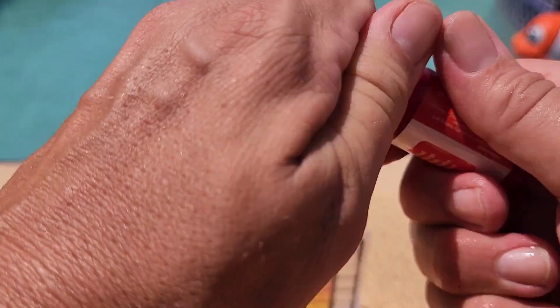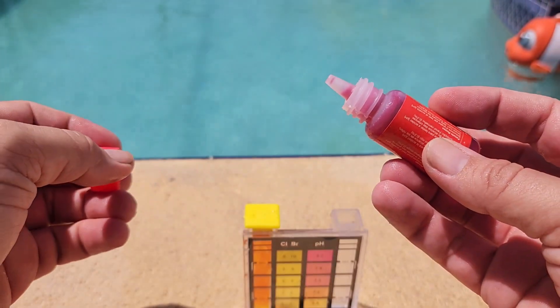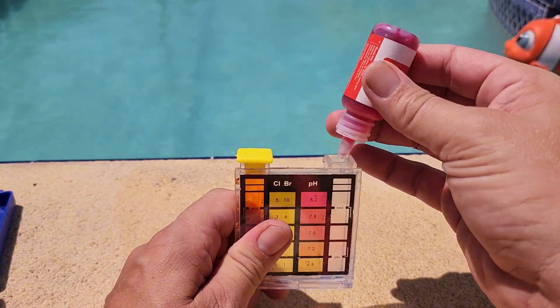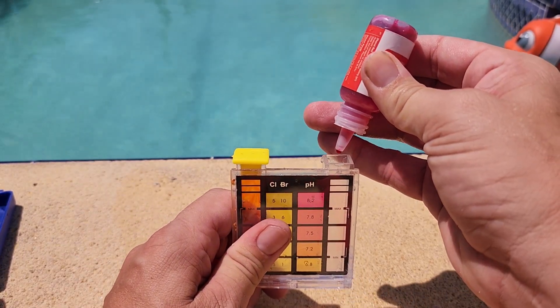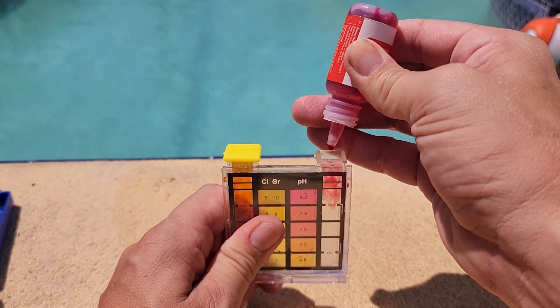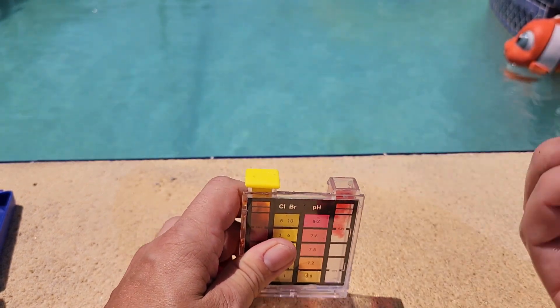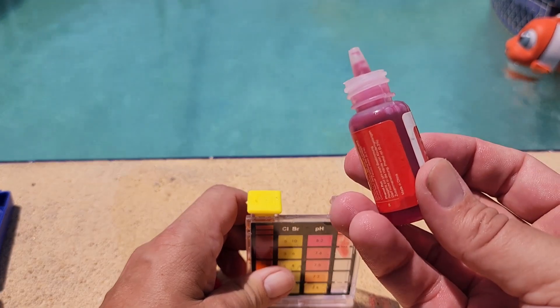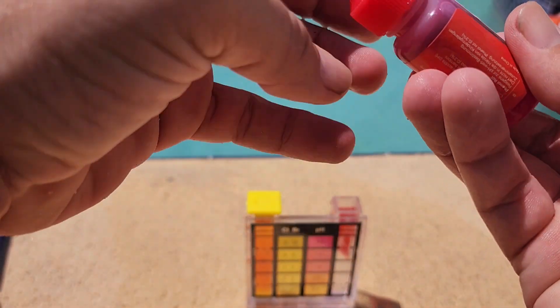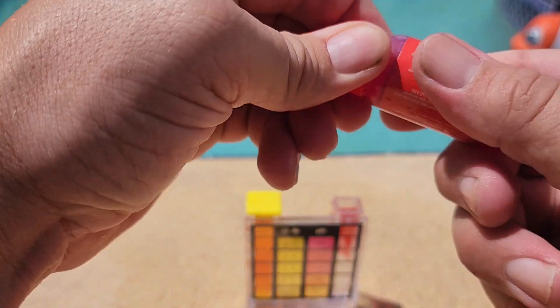On the right side, we are going to use our red solution and do the five drops again — one, two, three, four, five. With this kit you have to be very careful because it is really easy to get multiple drops out at the same time, so you just want to be careful and go slow.